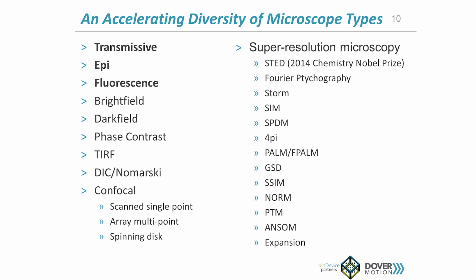Might point out, however, that on the super resolution column on the right, Steve was actually the designer of the very first commercial F-palm microscope. That project was a lot of fun.